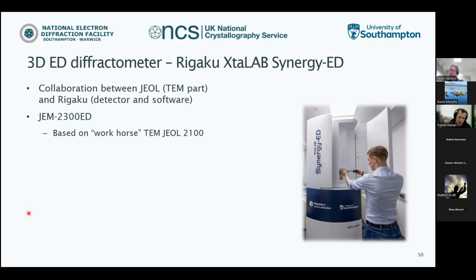And the other company is Rigaku, who develops and produces X-ray diffraction equipment, single crystal, powder, and also some other things. For here, they make their own detectors and software. So this is quite a nice collaboration, I think.